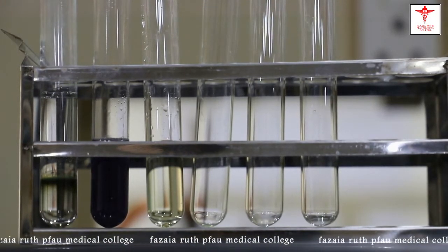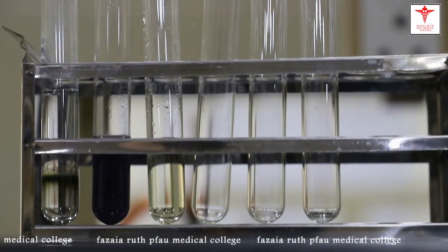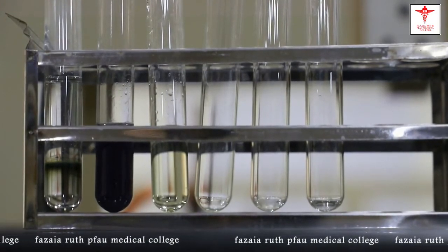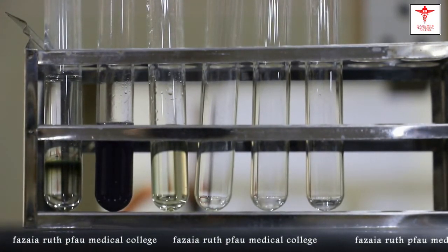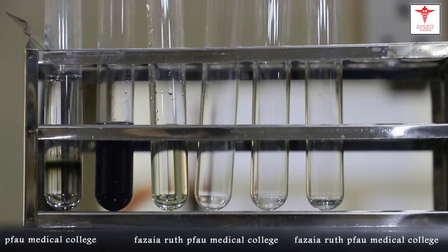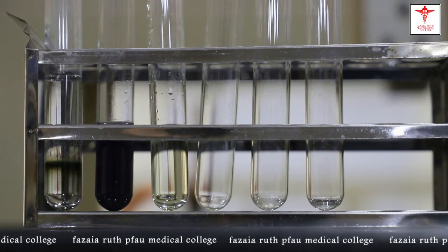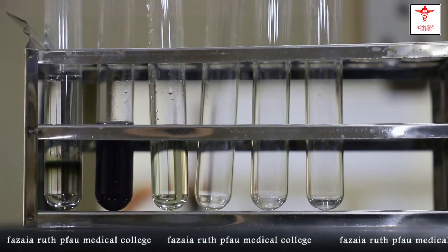And in the other test tube, there is a slight color change, but this is the original color of the iodine. This is not the color change because of presence of polysaccharide, rather it is color change because of iodine solution itself. So the appearance of this blue color is showing that the sample contains a polysaccharide.